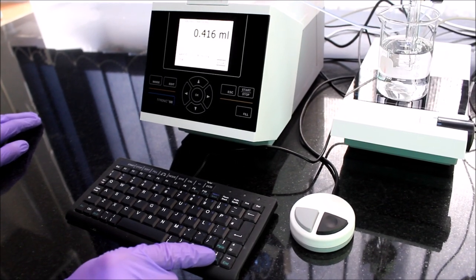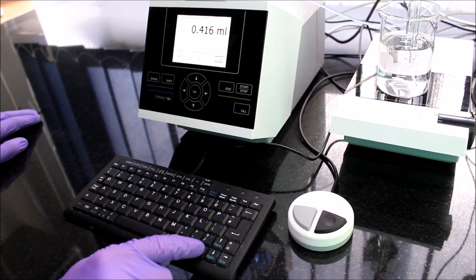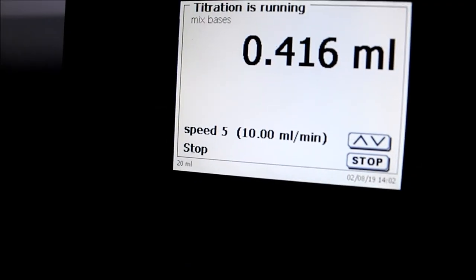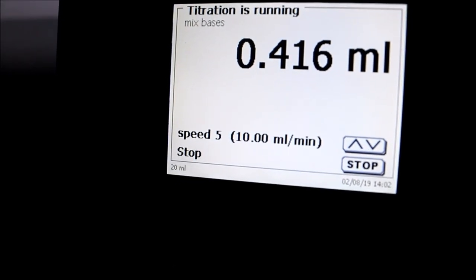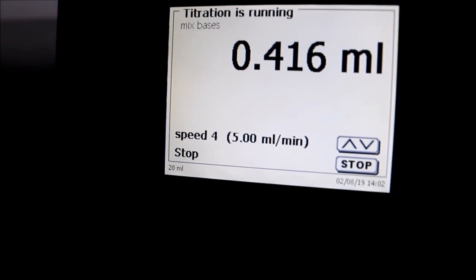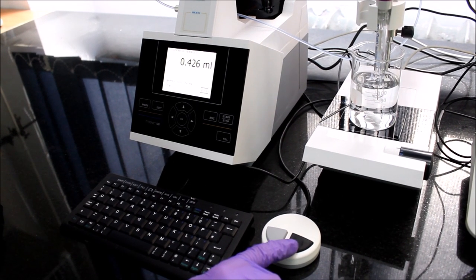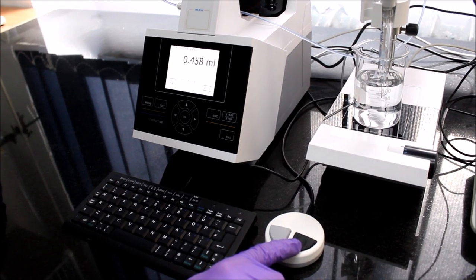We can change the speed of continuous delivery using arrow keys. The screen shows the rate of solution delivery on each speed profile. So now I change the speed and you can see that the rate of delivery has decreased.